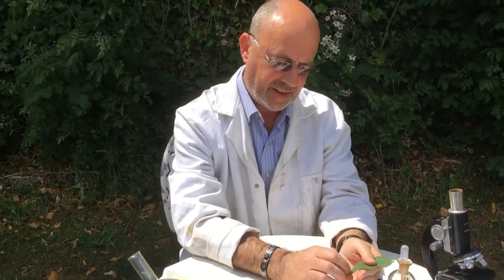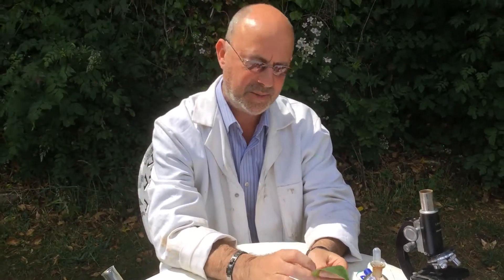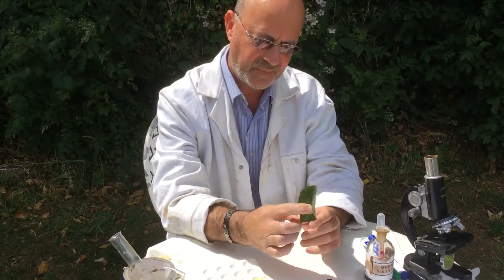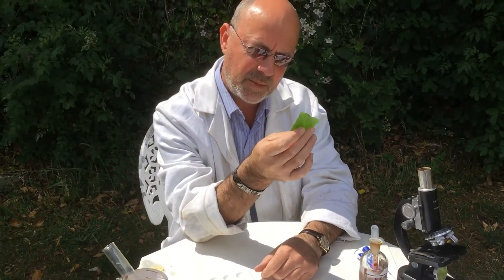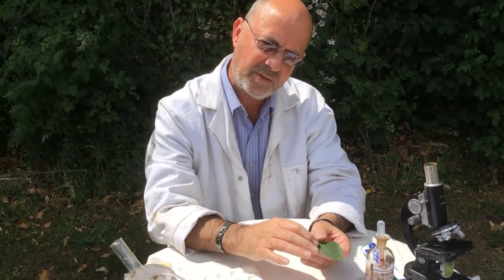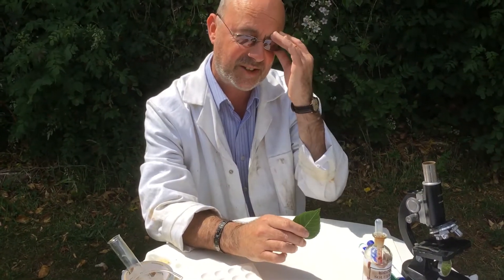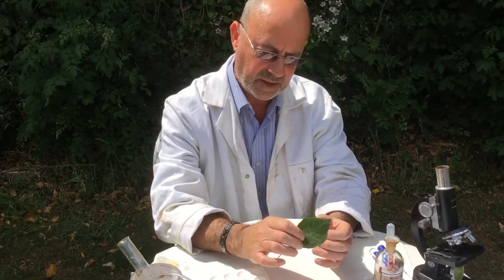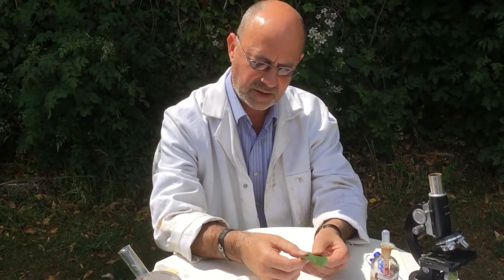Hello. Here we are in our outside lab. Last week I did something with this leaf. Can you remember what I did? I used a couple of chemicals. The first one was to remove its green colour called chlorophyll — an important word. Some of you actually wrote that in your diagrams, putting chlorophyll and chloroplast, which is amazing. The chlorophyll is the green colour, and I removed that so we could see the important starch underneath.